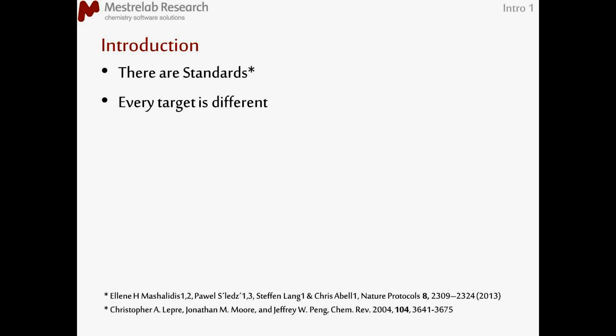Just to let you know that there are things to help you start setting up your screen, and that will later help to make your process as automatic as possible, from acquisition all the way to the bit that concerns interpretation of results. And also, I'll mention this later on. Please bear in mind when you are starting this, I know that for some of you who are already here and are very experienced this is pretty obvious, but for some people it's not. Every target is different, and what we consider acceptable results for one target will not be for another target, or call it protein.